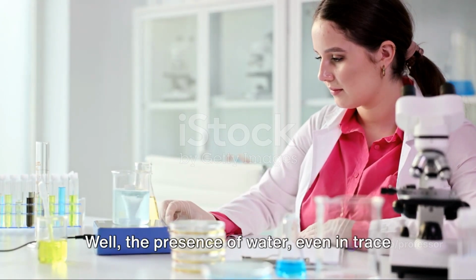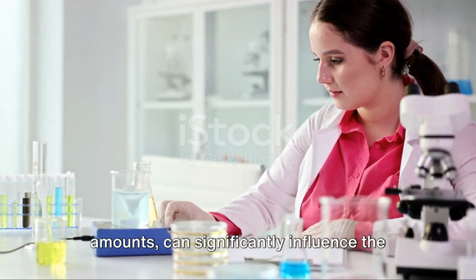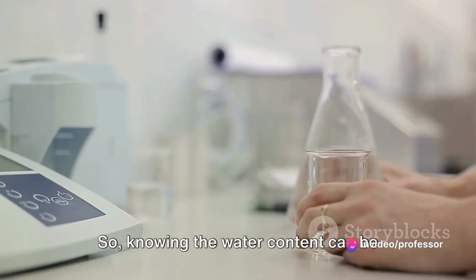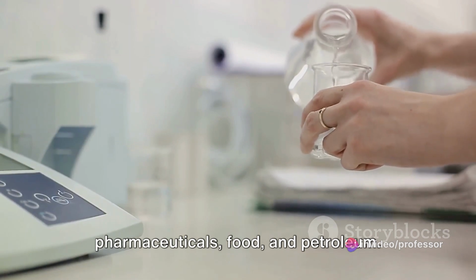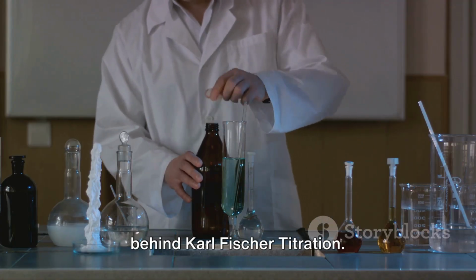You might ask. Well, the presence of water, even in trace amounts, can significantly influence the properties and quality of many substances. So, knowing the water content can be crucial in many industries, such as pharmaceuticals, food, and petroleum. Now let's delve into the principle behind Karl Fischer Titration.